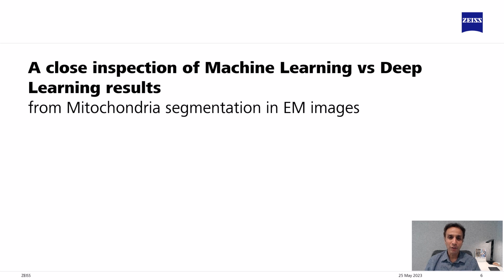Hi everyone, in this short video, let's have a look at the results of mitochondria segmentation in electron microscopy images using both machine learning and deep learning techniques. And the goal here is to understand how machine learning quickly reaches its limit when it comes to segmenting these complex objects against complex background.